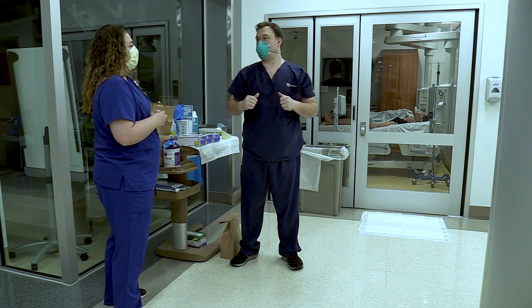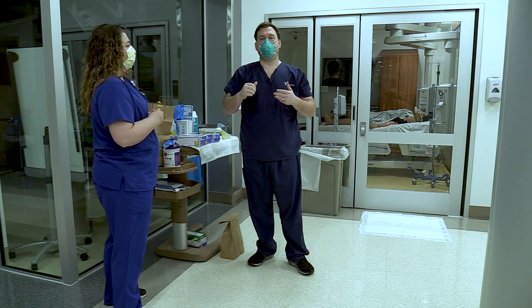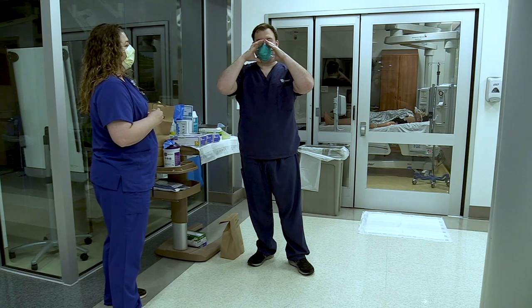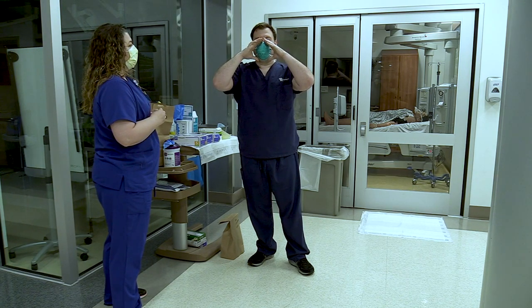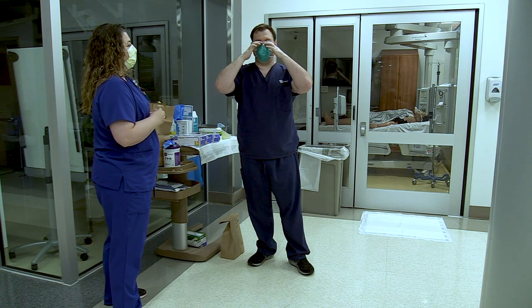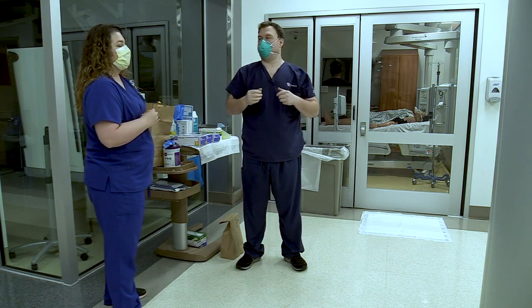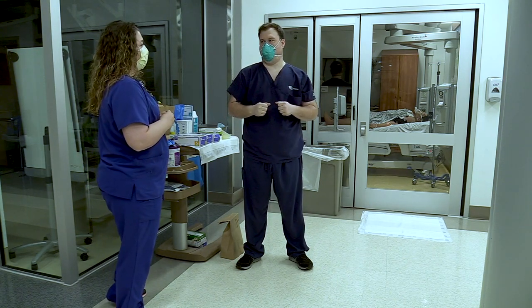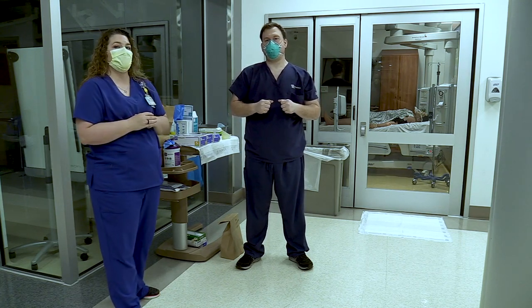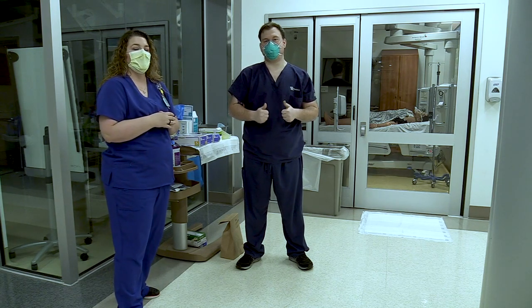Once he's molded his nose piece, he's going to check for a seal. Take a big deep breath in and a big hot breath out, and feel around the edges of the N95 to see if any air is leaking around the edge. You only want air coming through the front where filtration happens. CDC recommends that if you have a beard, it's less than a quarter of an inch. For those with longer beards, trim down to less than a quarter of an inch or clean shave to use the N95.